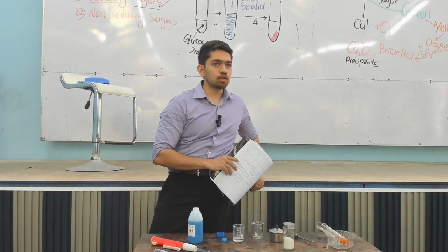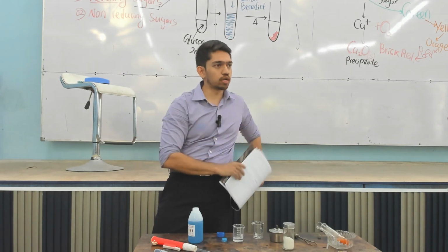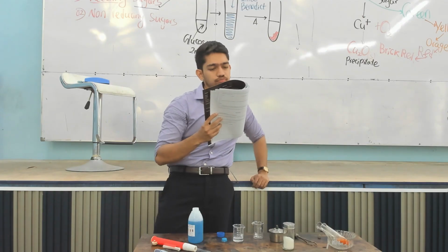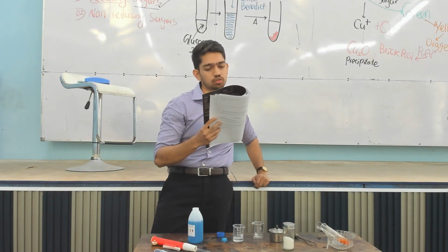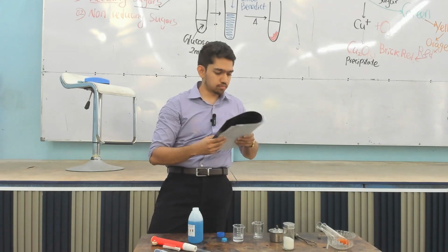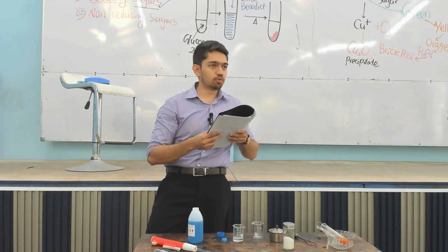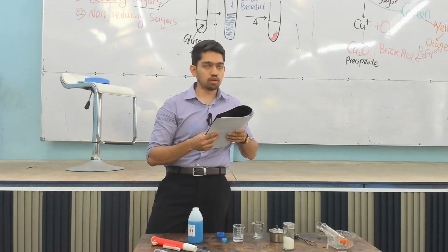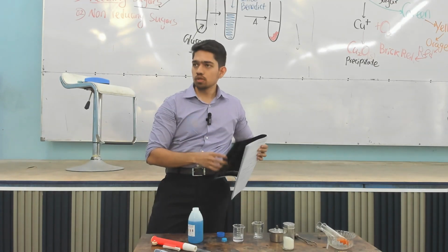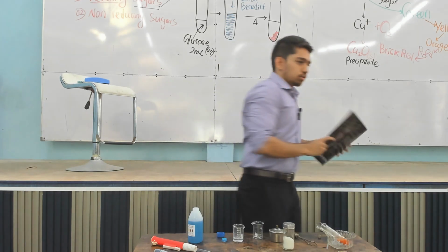The sucrose is broken down to its monosaccharide parts, glucose and fructose. Carefully neutralize with sodium hydrogen carbonate. Check with the pH paper. Add an equal volume of Benedict's solution. Shake well and boil in a water bath. The initial blue color changes to a brick red precipitate. Same story. So that's what we are going to do now.